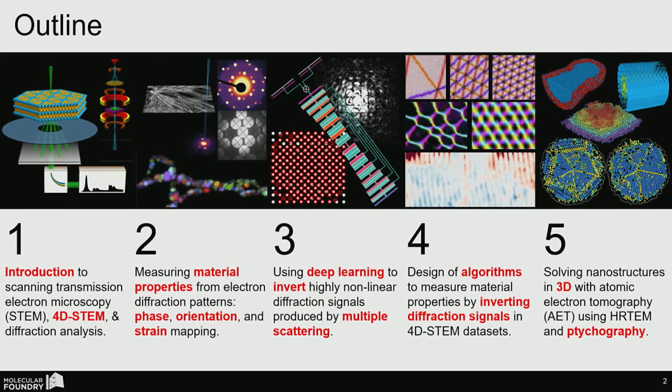And then I'm going to end with the original topic of my talk, atomic electron tomography, with some examples in plane wave HRTEM that didn't work so well, and then some ptychography examples that worked much better.